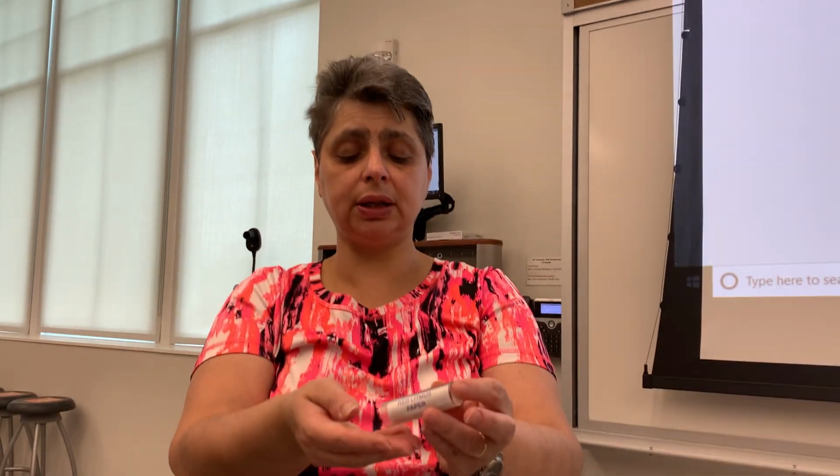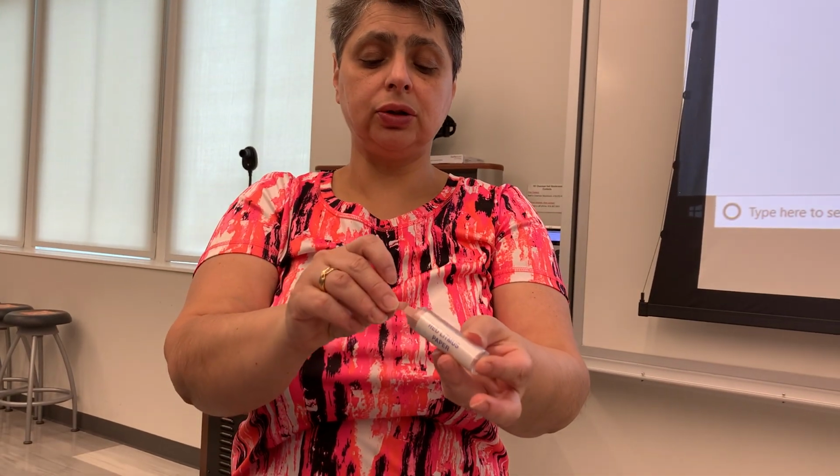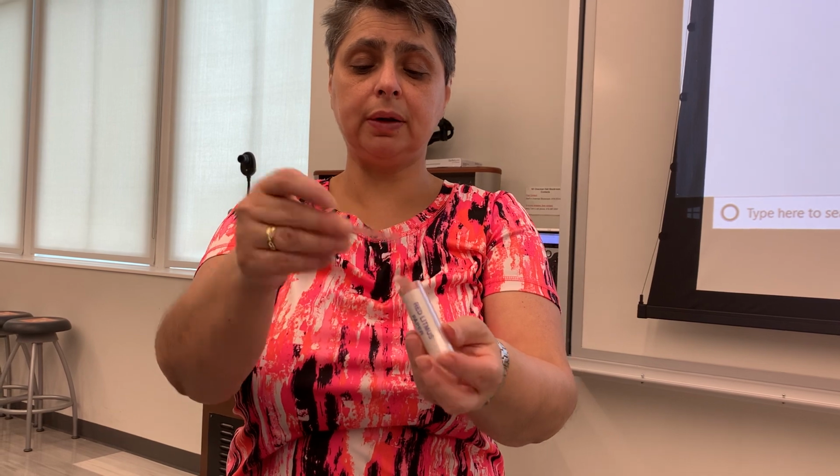So what you're going to do is carefully open the container, tap on it, and get a strip like this out. You're going to hold it on one end like this, like I'm doing now, making sure the other end that you're going to use for testing is not contaminated with any chemicals. You may put it down if you need to, but only on a clean surface. Don't put it on a dirty bench. Put it on a watch glass or some other clean surface if you have to.